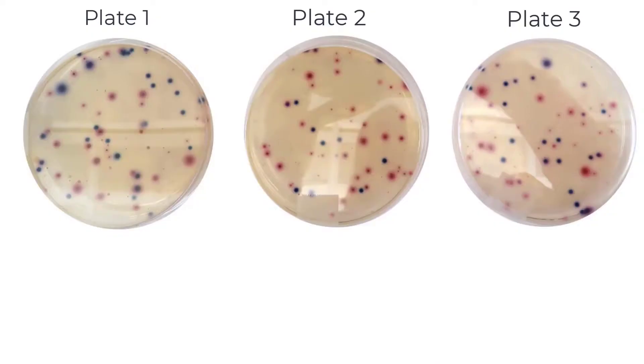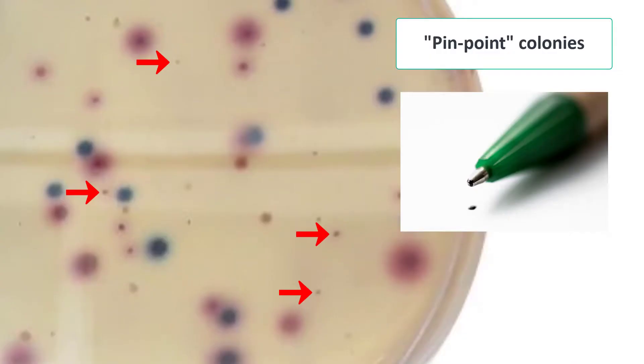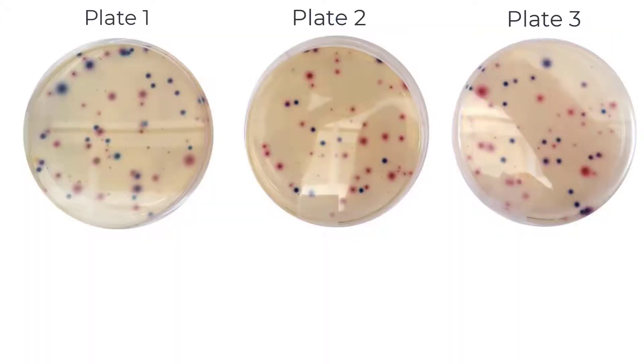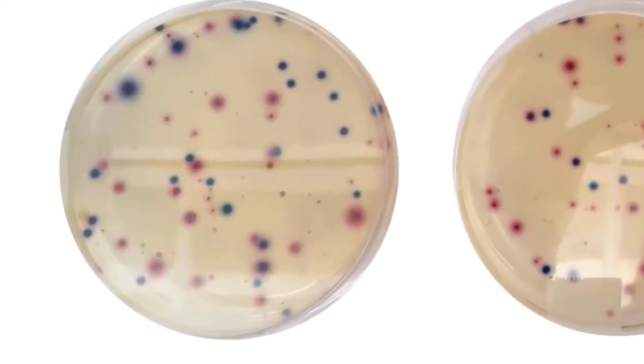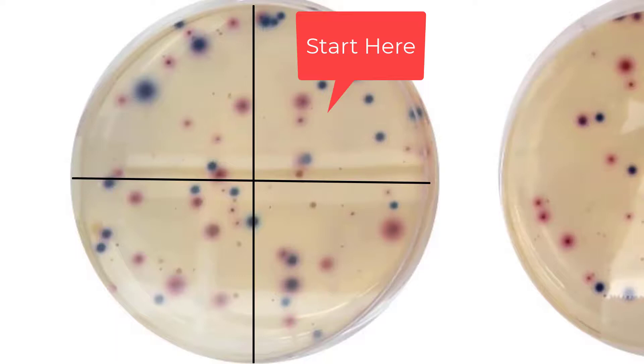Let's practice counting other coliform colonies on our three plates. We will count all of the pink to dark red colonies on each plate as other coliforms. Remember not to count the very small pinpoint colonies. We will start back at plate 1, and since there are a lot of colonies, let's bring in the quadrants, starting in the top right quadrant and moving clockwise.